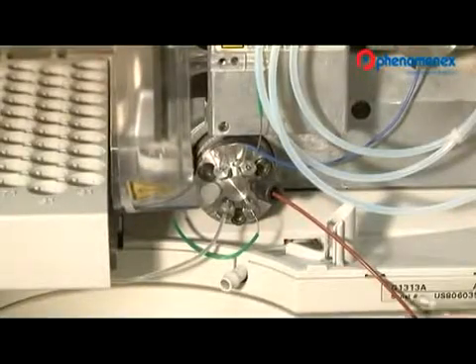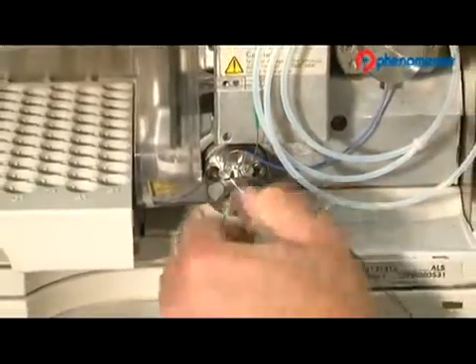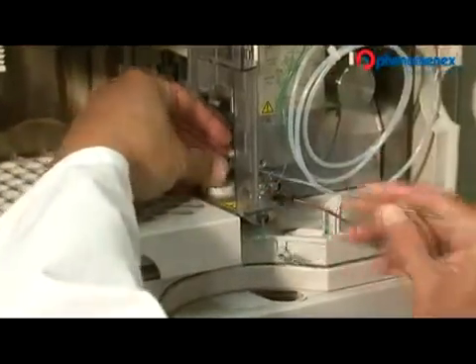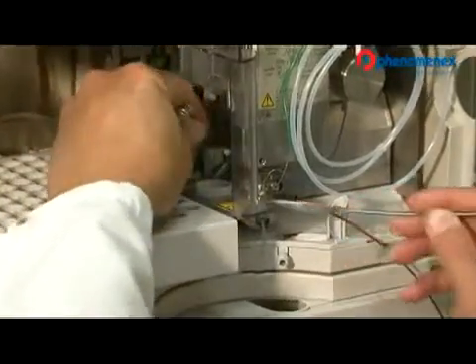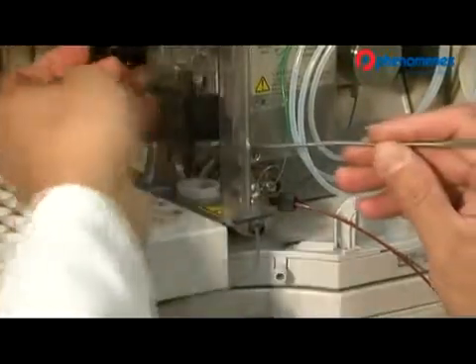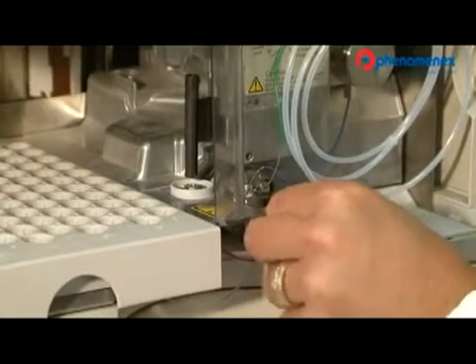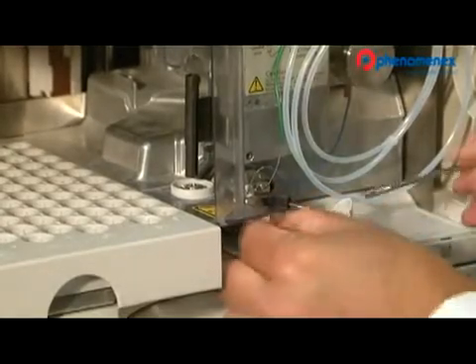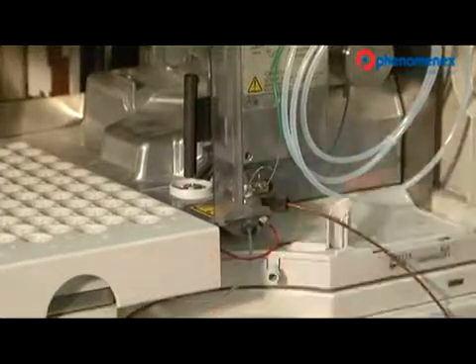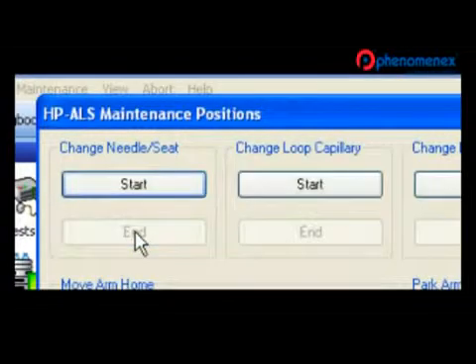I'm disconnecting the current needle seat — first removing the connection to the injector valve, and then with a gentle pry I can remove the unit from the housing with a spatula. Now I can replace it with the low volume needle seat, reconnect the fitting, and with a quarter turn at the end — there. Remember to come back to the software and end the program, or you will have some big problems.